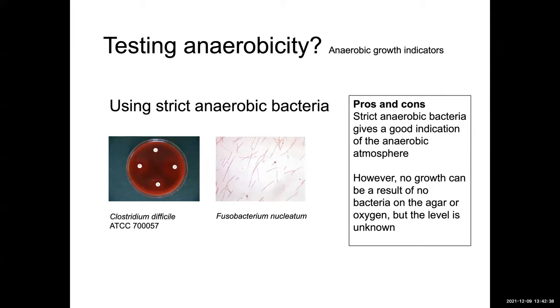It could be a result that you did not put any bacteria on your plate. And also you cannot really say how much oxygen was present in my incubator or jar when I performed my tests. So it has also some drawbacks, this type of control.